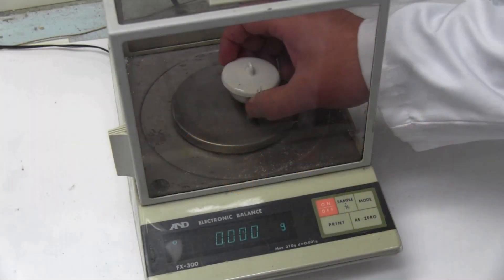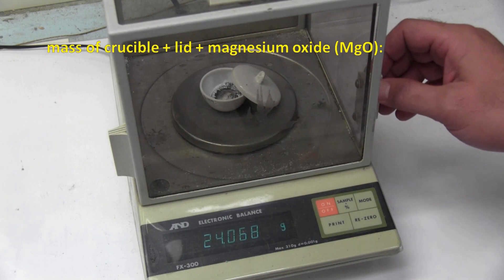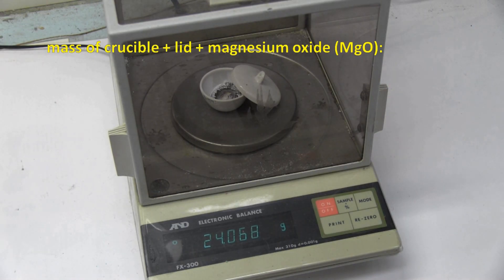If we now re-weigh the crucible, its lid, and the magnesium oxide, we find that the combined mass has increased to 24.068 grams.